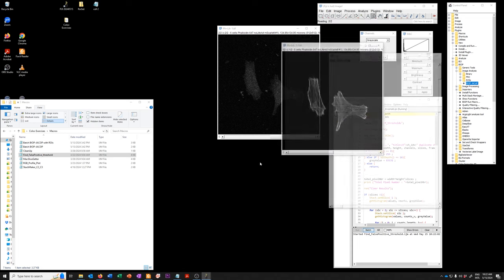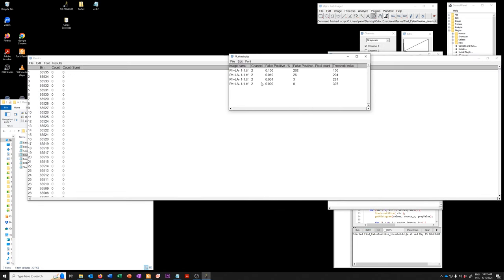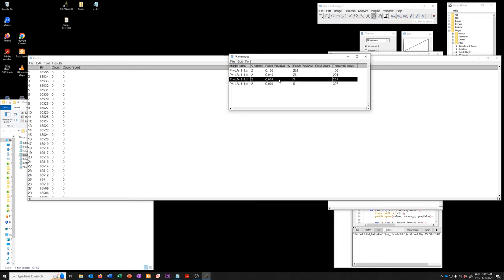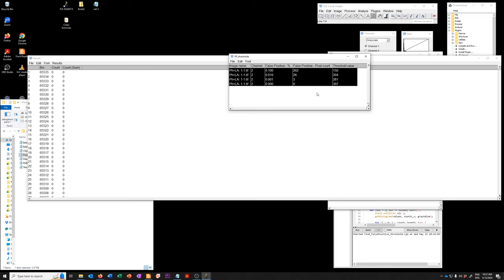So if I say okay it goes and opens that image and it creates this where it says if you accept this number of false, this fraction of false positives, then your threshold value will be this. So the fewer false positives that you accept, obviously the higher the threshold value will be.